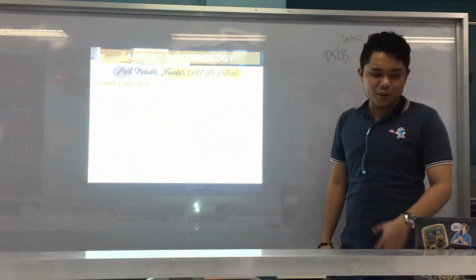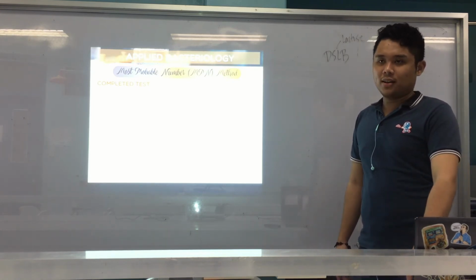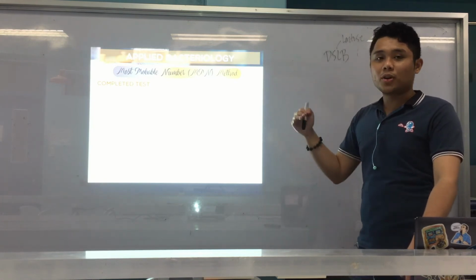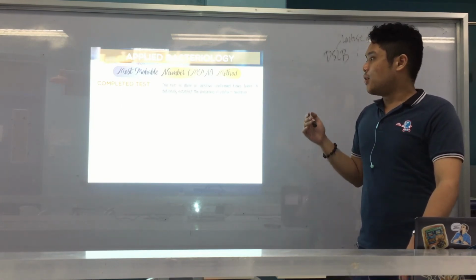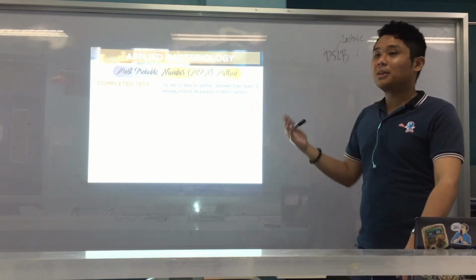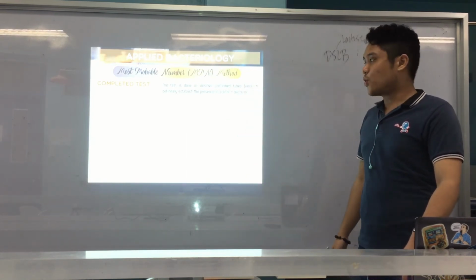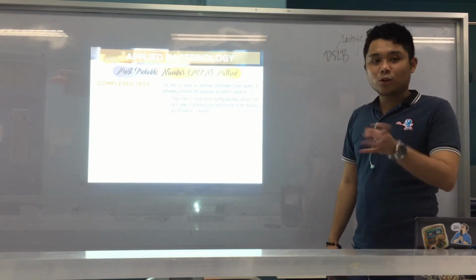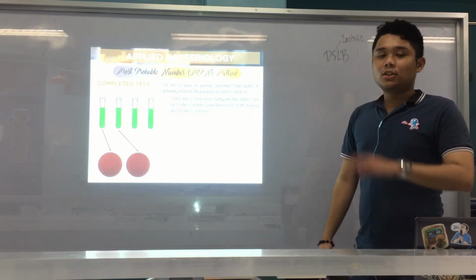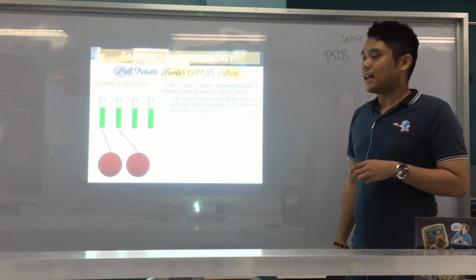For the completed test, usually this is not performed now. Okay? Not performed usually. Usually, it stops at brilliant green, the confirmatory. But next to the confirmatory, we perform the completed test. Now, again, this is done on positive confirmed tubes, to definitely establish the presence of coliform bacteria. So, what we do is, those positive in BGLB, we streak to EMB, eosin methylene blue, alright? Streak for isolation.